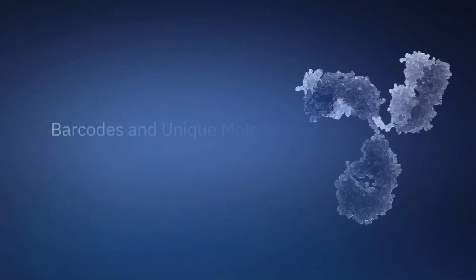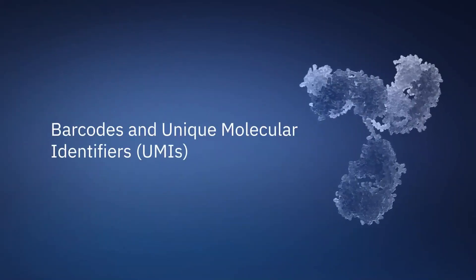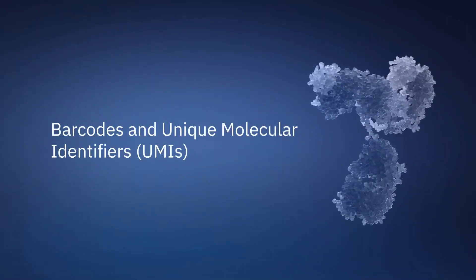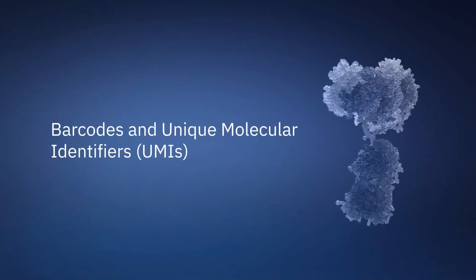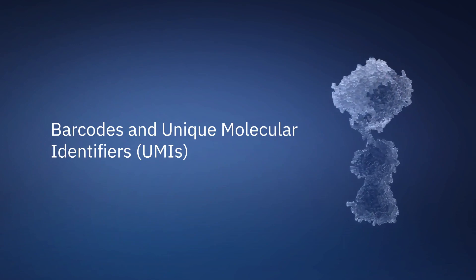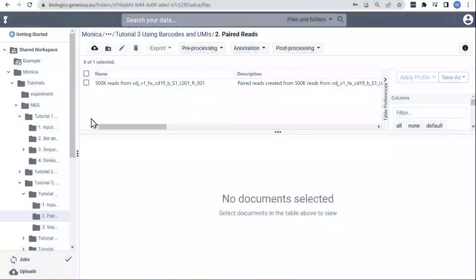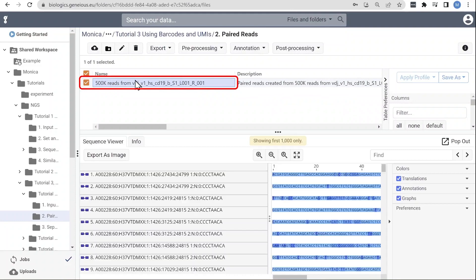Some sequencing processes add nucleotide barcodes or unique molecular identifiers, also known as UMIs, to antibody sequences. Barcodes are used to assign sequences to different cells, plates, or wells, while UMIs identify rare variants and enable you to screen out probable sequencing errors.